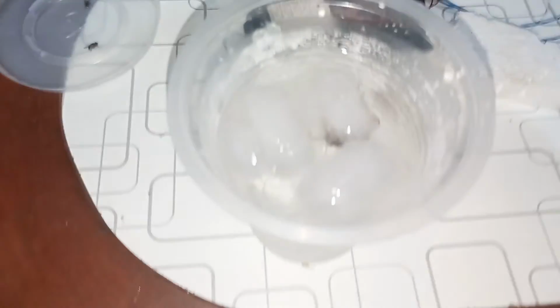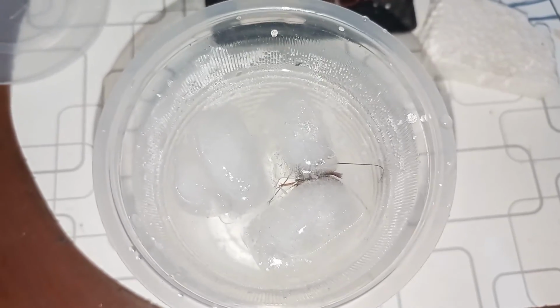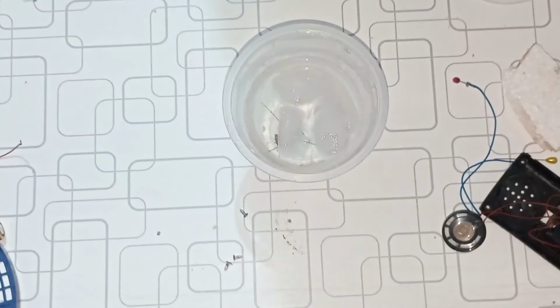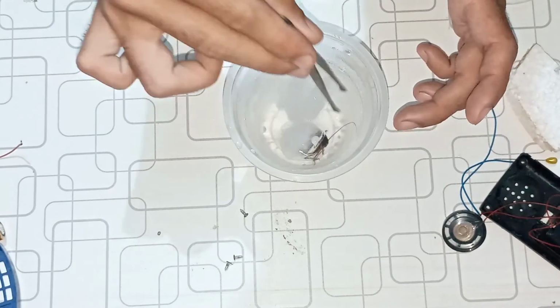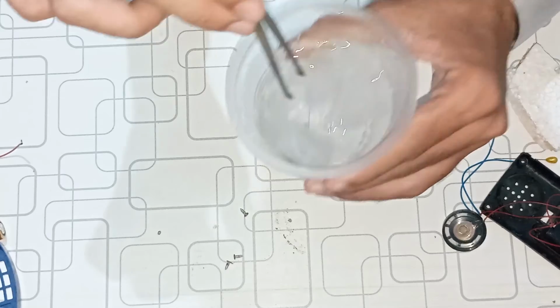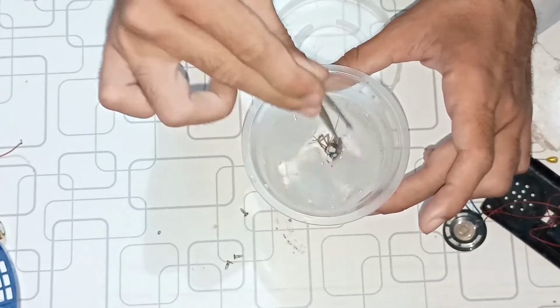As you can see, I put the cockroach in the ice water for a few minutes, and after that it goes into the anesthetic condition. Now viewers, my cockroach is in a complete anesthetic condition. So it's time to take it out and then cut out its leg.